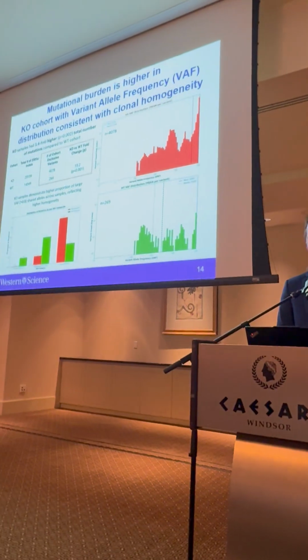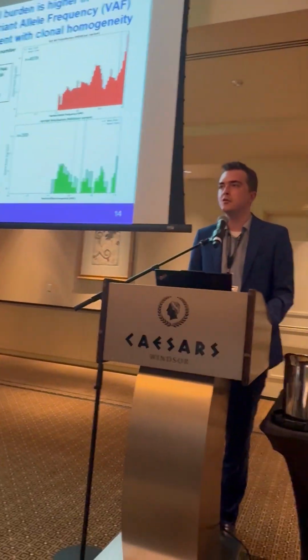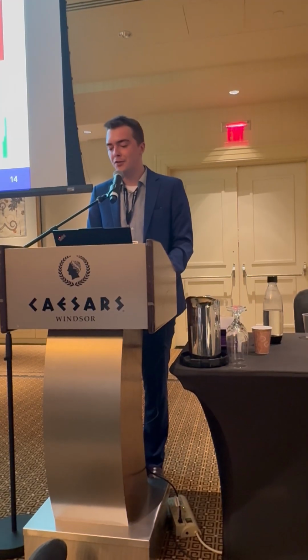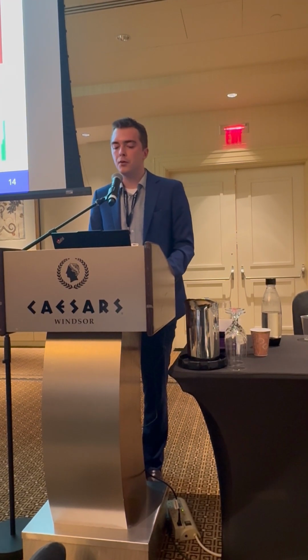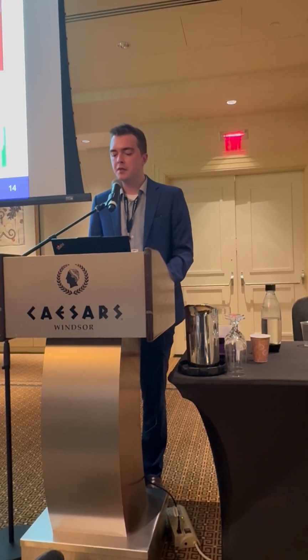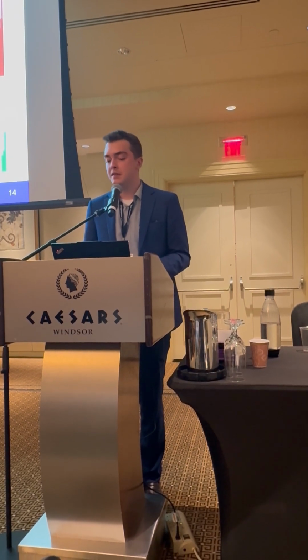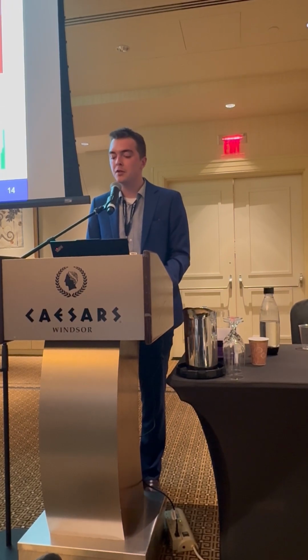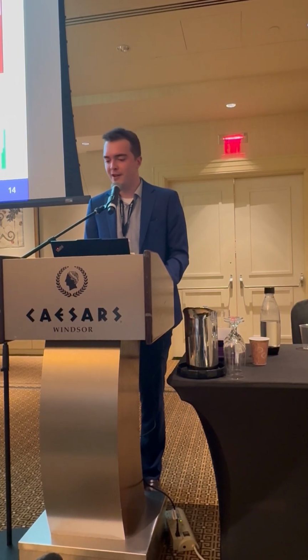Okay, now going over those results where I compared the mutational burden and relative variant allele frequency distributions, acting as a measure of clonal heterogeneity, we saw some quite interesting results and some pretty clear indications of the genetic differences between these two cohorts or genotypes. First, the total number of SNVs and indels combined between all 4 mice between the knockout and the wild type samples were statistically significantly different, with the knockout containing a 1.6-fold higher mutational burden than the wild type, with a pretty low p-value of 0.002.